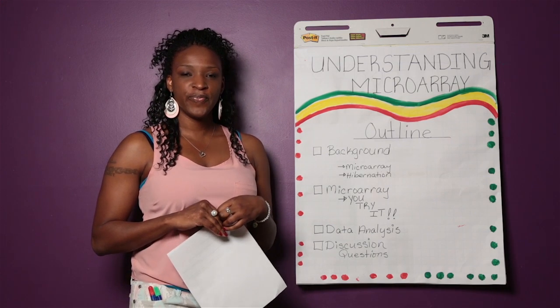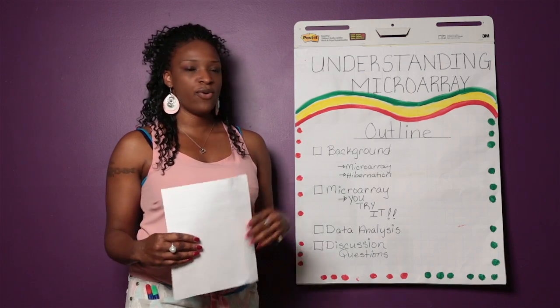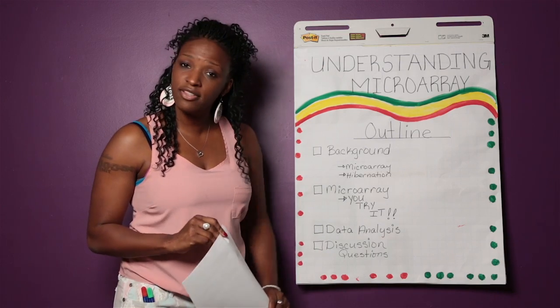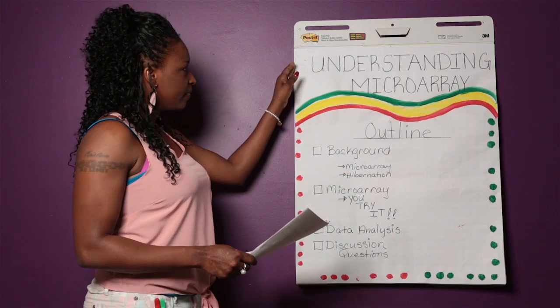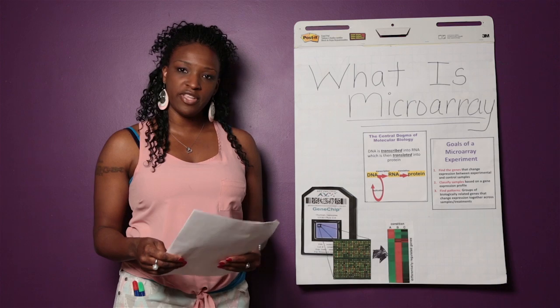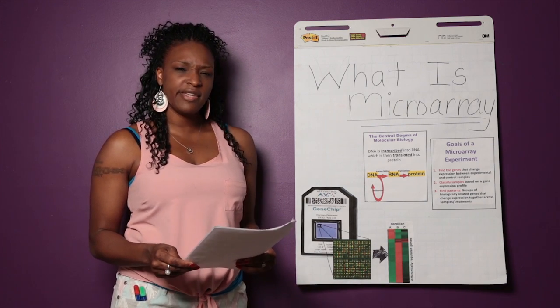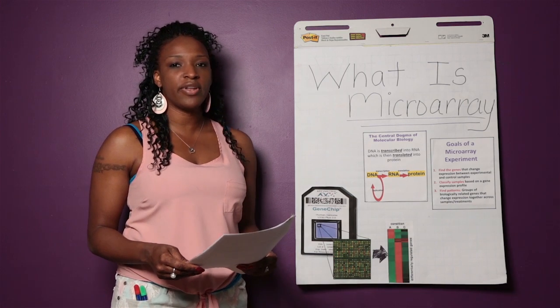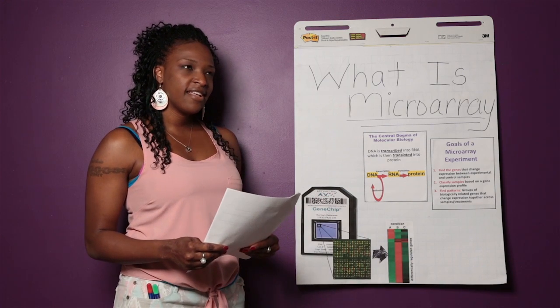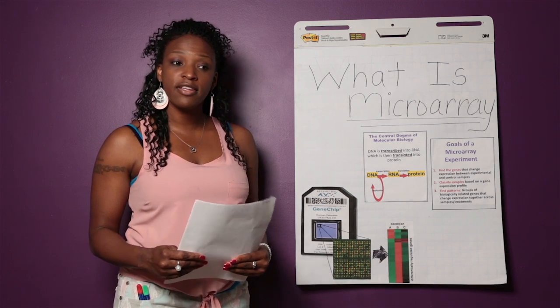Alright, so welcome back. Hopefully you've decided what group you're in, summer or winter. Now the next step is, what is microarray technology and how are we going to use it today? So microarray analysis is used in molecular biology and as a diagnostic tool to see what genes are upregulated or downregulated under certain conditions. So if you think about it in terms of puberty, what happens when we hit puberty?